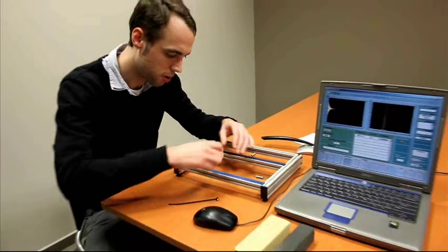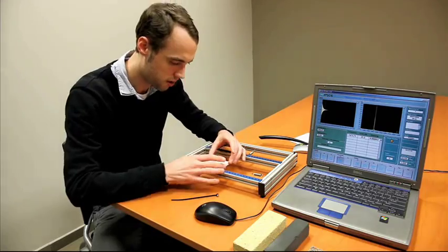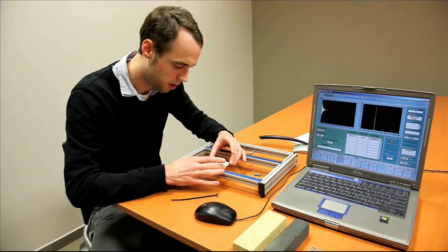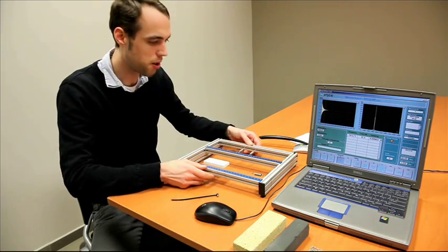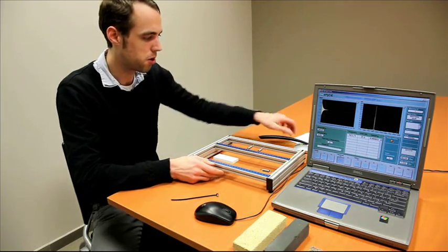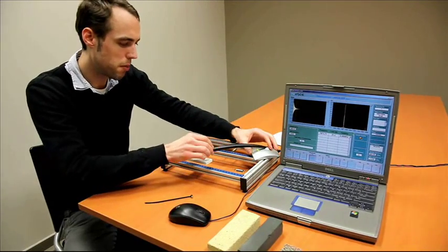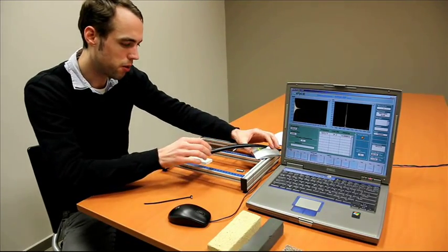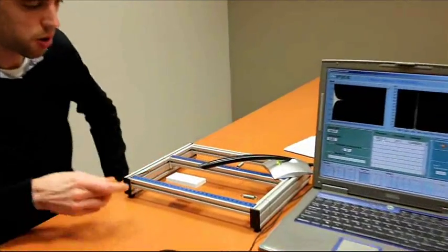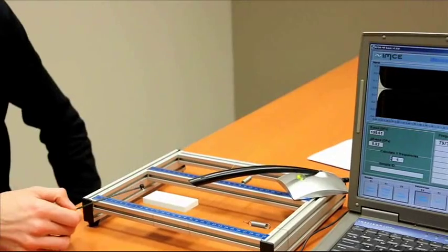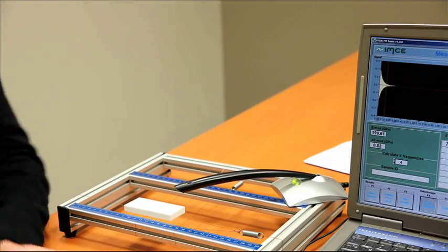Let's change the setup a little bit. We support the sample in a cross, position the microphone in one of the corners, and we are going to tap the sample in the opposite corner.